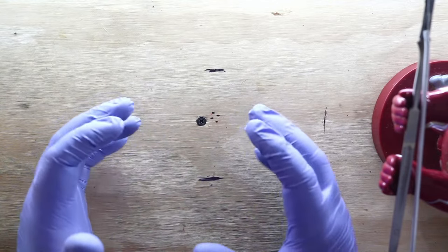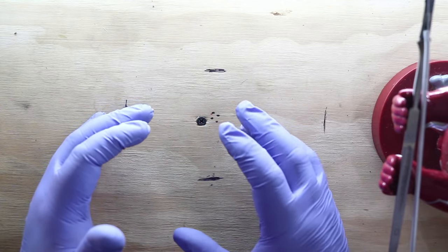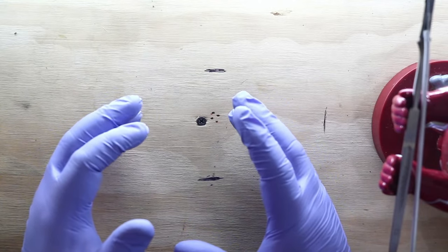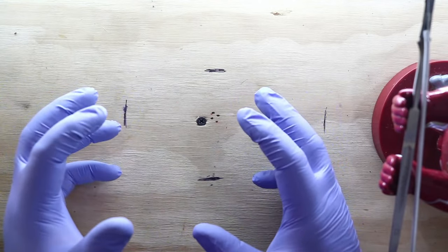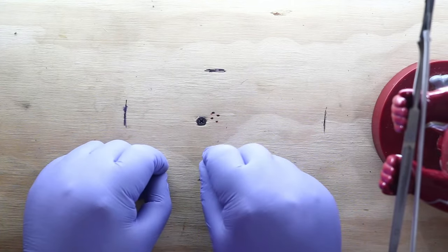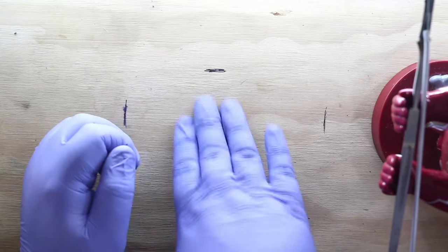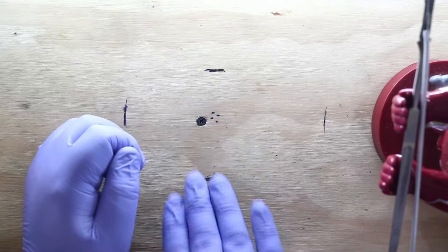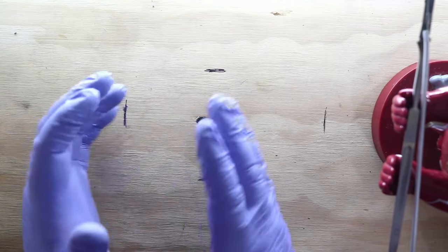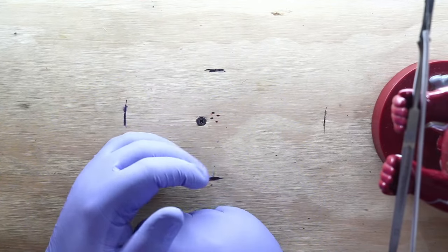In fact, a lot of times when I do mentorships, I'll literally get behind somebody and we'll do the pottery and the ghost thing, where I reach around, grab their hands, and literally do it for them with their hands so they can feel the actions, because people want to stab with that needle. They just want to stab. They can't get it out of their head to stab. And we're not stabbing with the needle. We're coring with the needle. So.